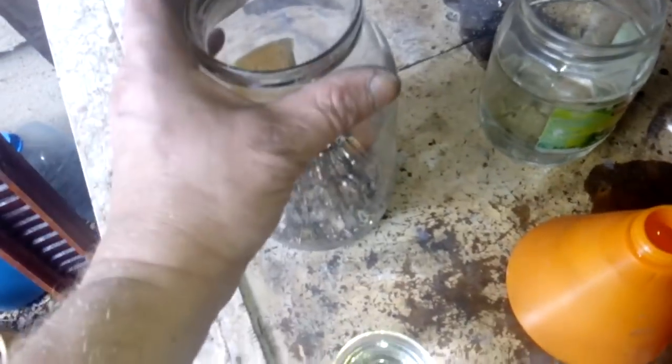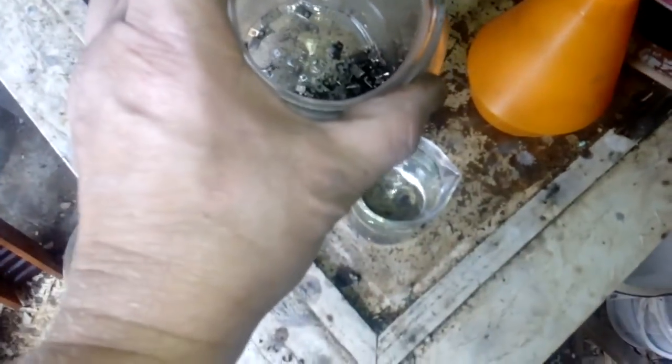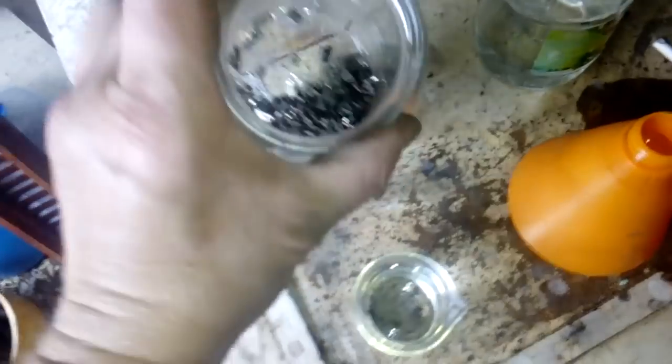Hey friends, everybody loves silver, so today we will do some silver contact recovery. This silver contact is from some relays. Here I got 250 grams of silver contact together with the base metal, and we will use nitric acid to remove the base metal.